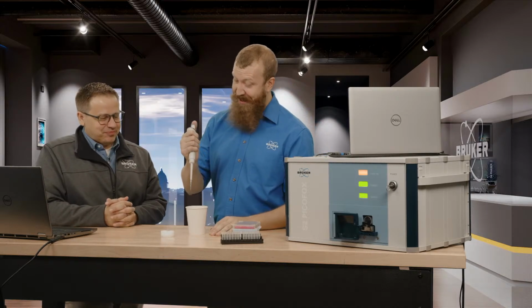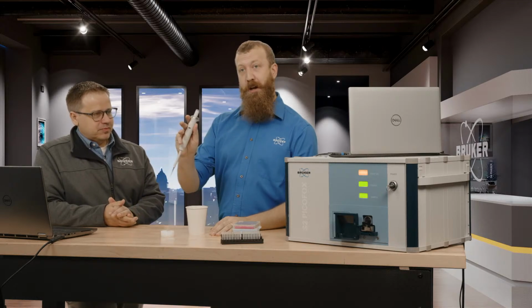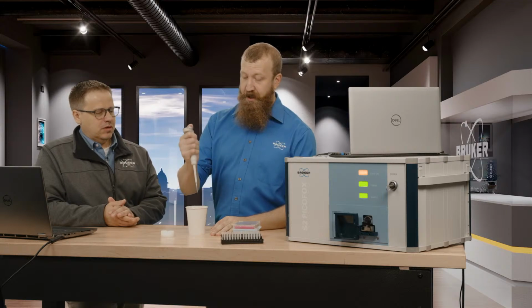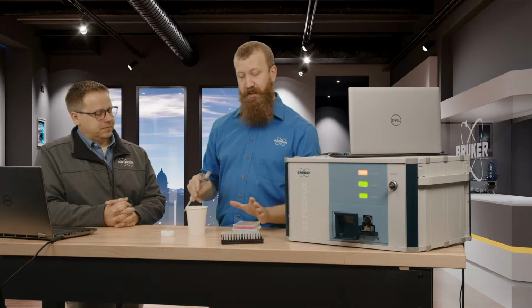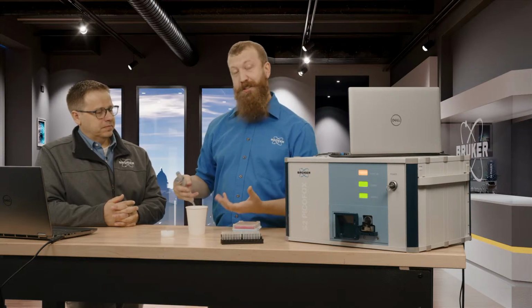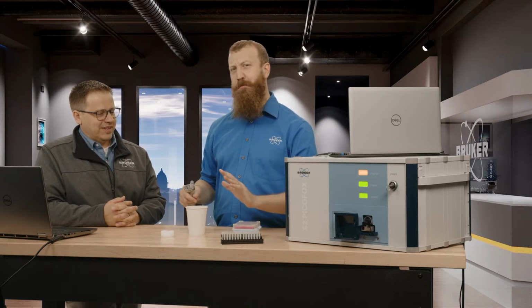No, I hope not. All right, so you got a pipetter. Yes, so we need to have one of these. An Eppendorf pipetter, 10 microliters. That's really all that we need to work with here. Because we're sampling this in qualitative mode, we're just looking to say, what can we see? We're not going to actually make quantitative measurements of it because we don't have any internal standard inside of my coffee. I like my coffee with cream, sugar, no gallium.